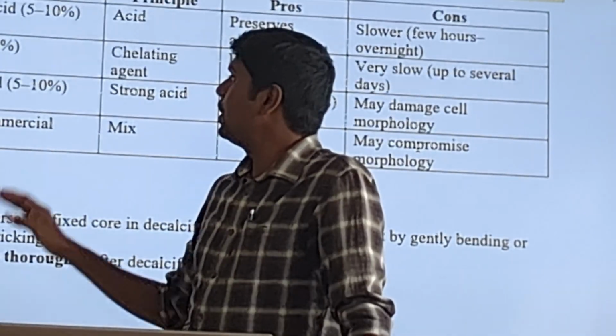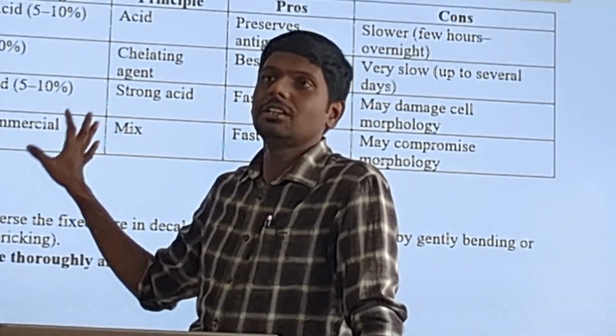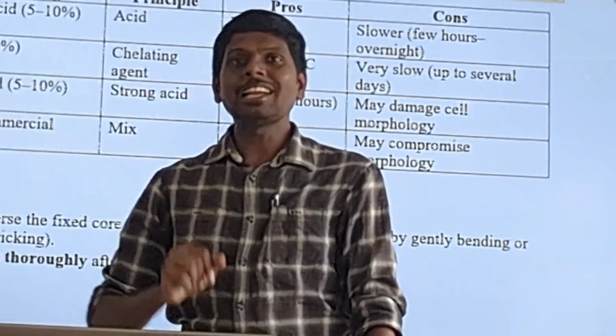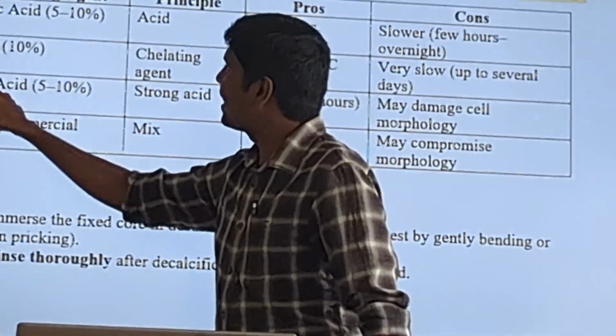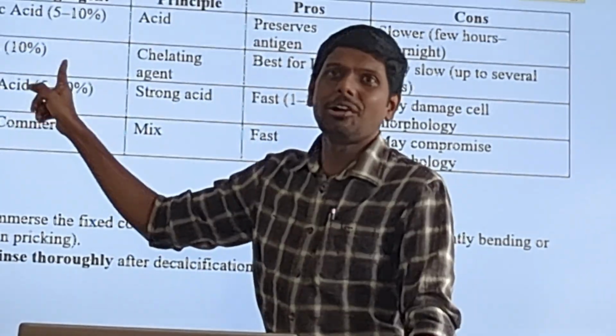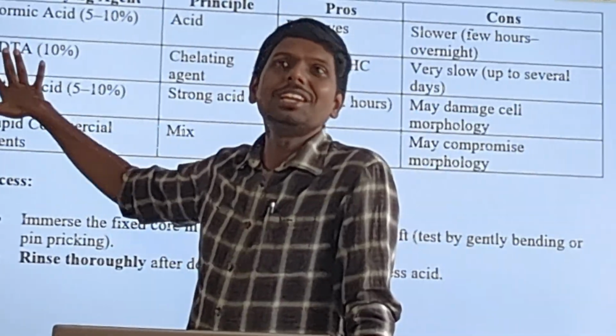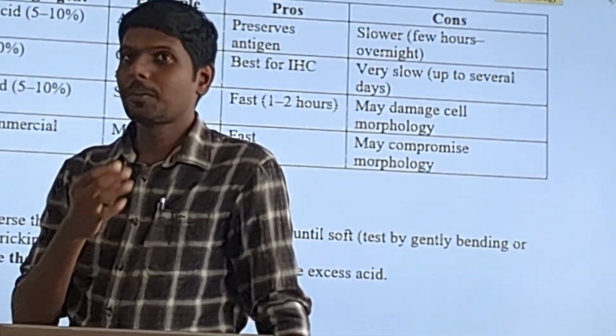Okay. If we do not do decalcification, it leads to this. Now, can you give me one explanation? If you see here, one of the methods of decalcifying is EDTA. Can you guess how EDTA will decalcify the tissue?